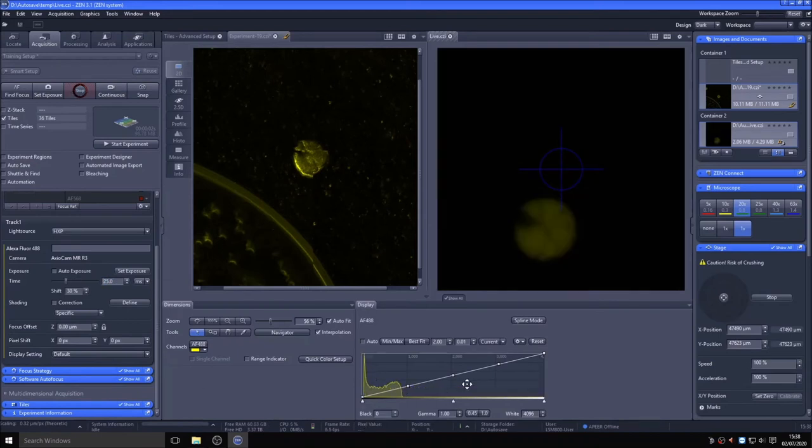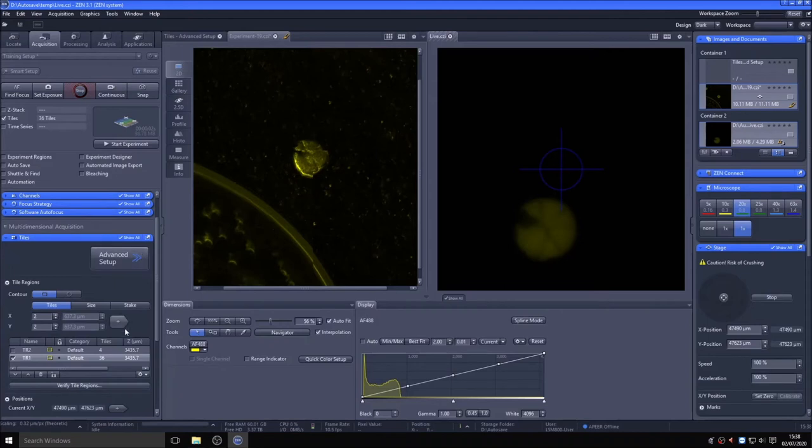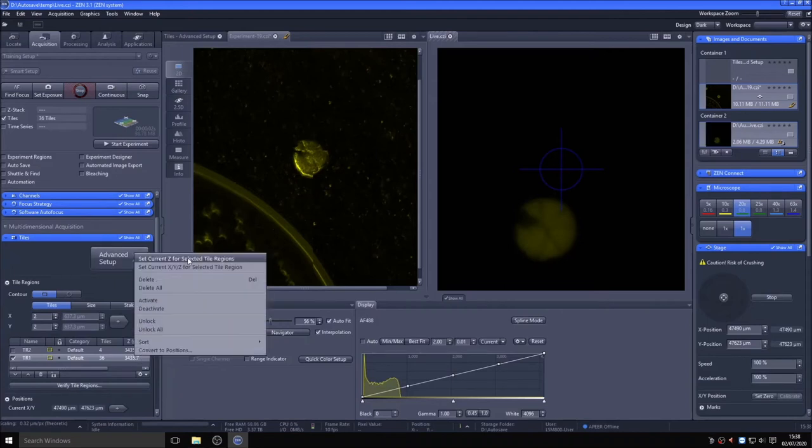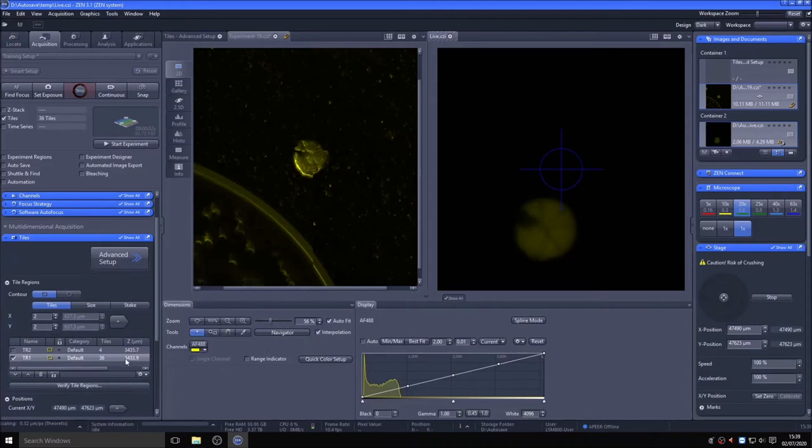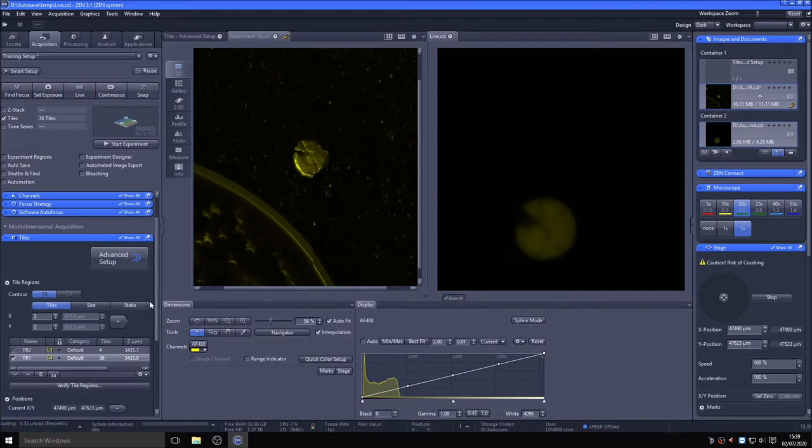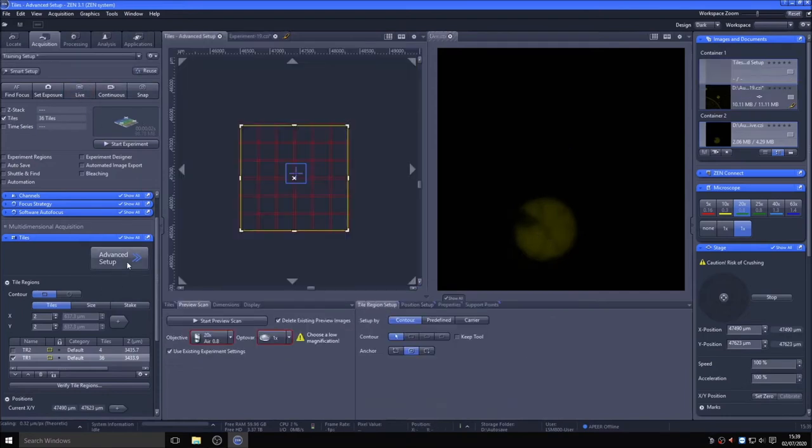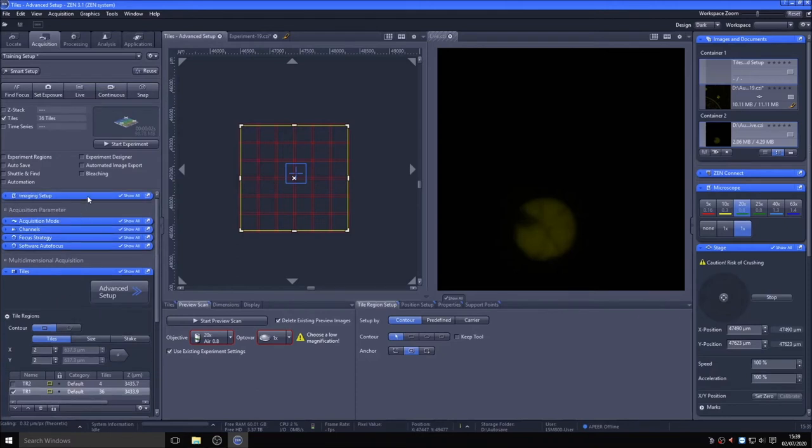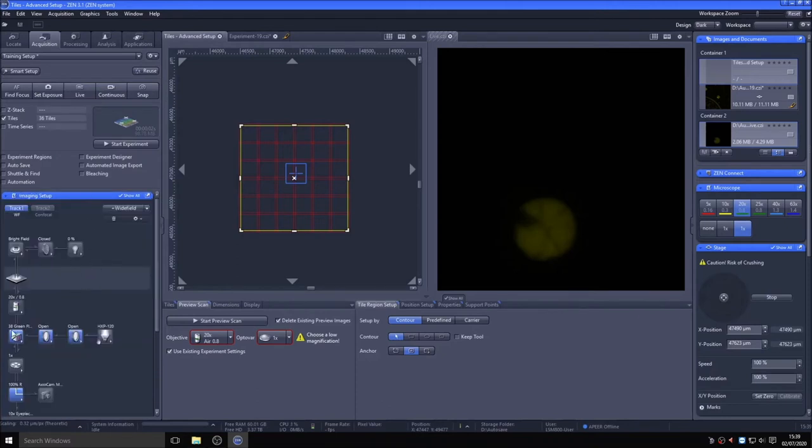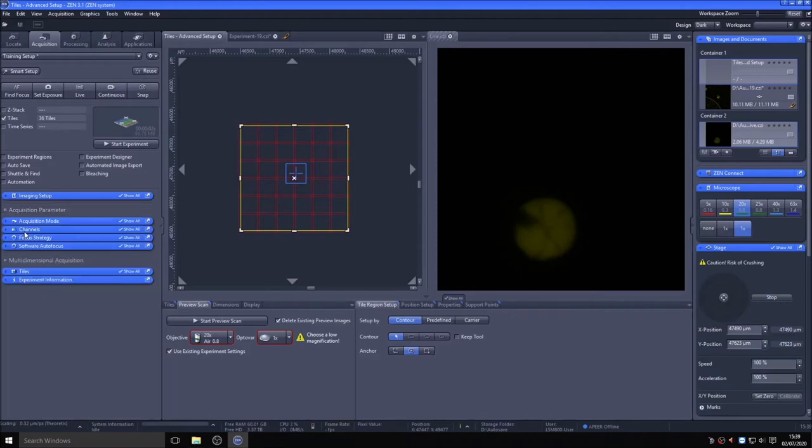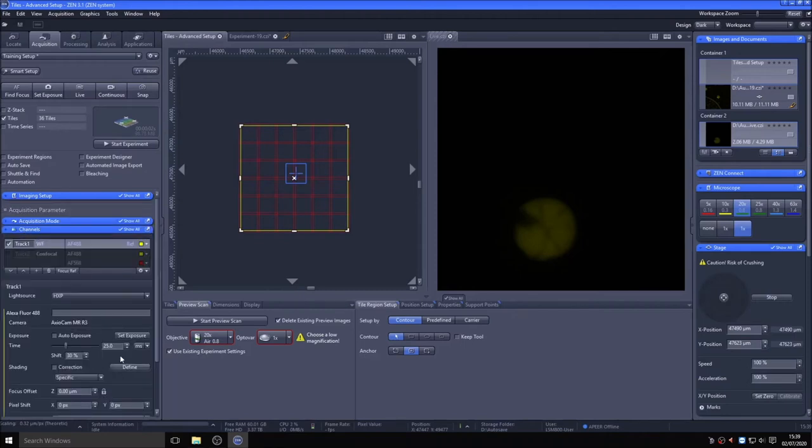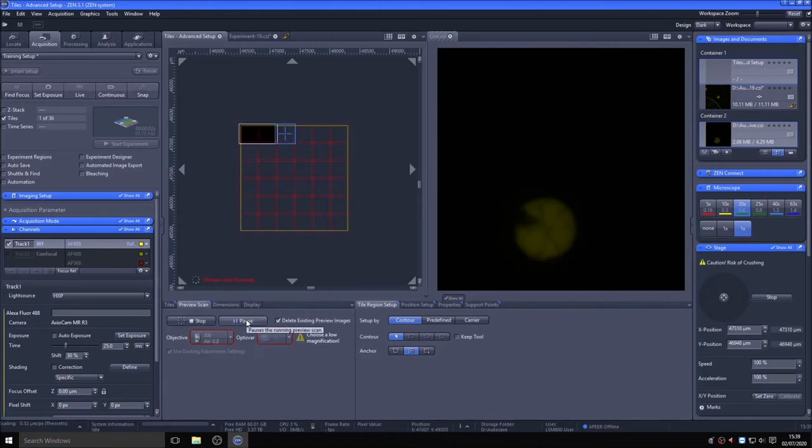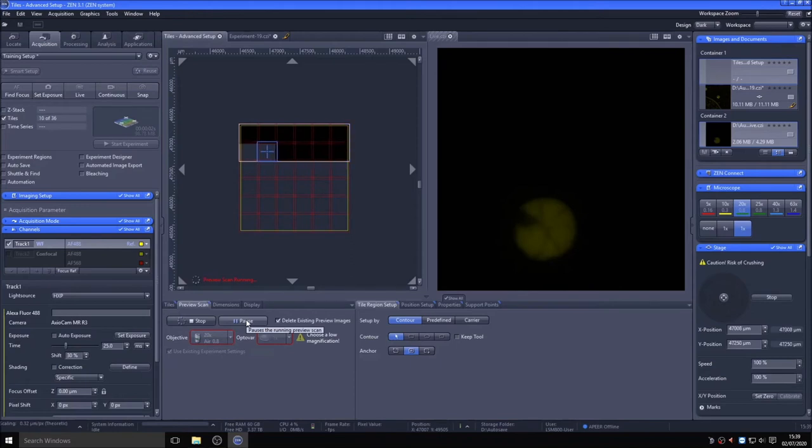In advanced setup of tiles, ensure that it is set to use the existing tile region and settings. Ensure the channels setting for the wide-field track are correct and that the wide-field track is selected in channels. Then, instead of using the Start Experiment button, use the Start Preview Scan button at the bottom of the tile image window. As we cannot use confocal zoom and the camera field of view is smaller than that of the confocal, it will take more time to cover the same area. However, as you can see when we carry out the preview scan with the existing experimental wide-field settings, it rapidly images the preview area.